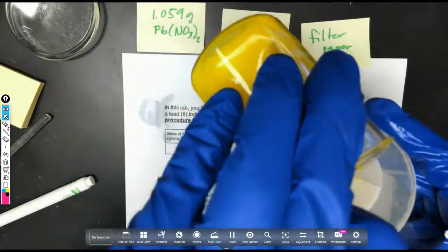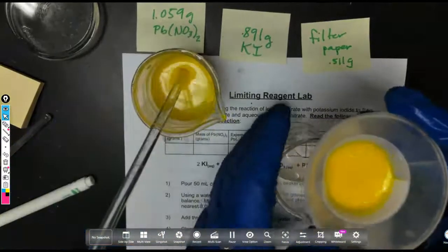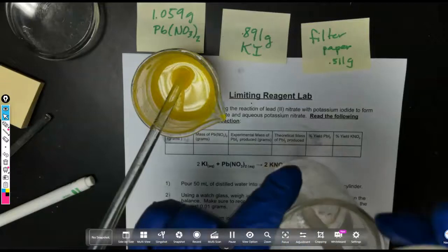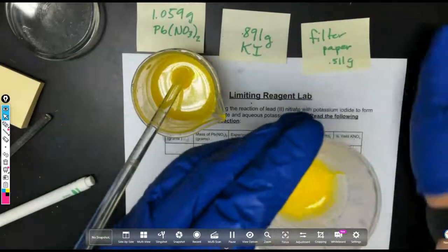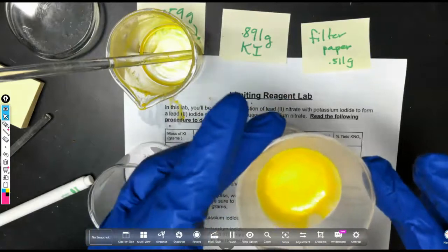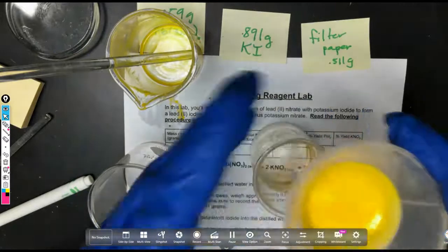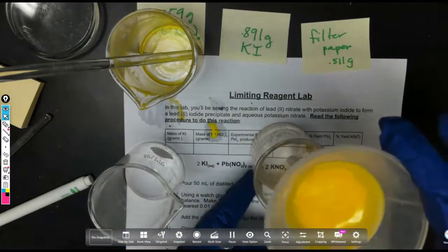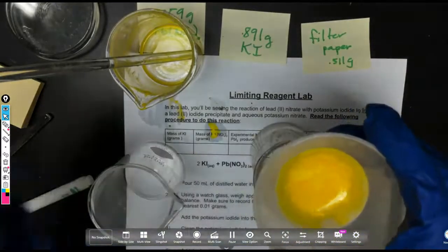So I'm going to start the filtration process. And as you can see, that is what it looks like right there. And it immediately starts filtering, and I'm getting a clear liquid as we go here. I'm going to pause my video and go ahead and get it all filtered for you as we go. Okay, we are getting close to the end of our filtering. There's still a little bit of liquid in there. You might also notice that I'm getting a clear solution that is our filtrate that is coming through, and I'm collecting the yellow particles of the solid in my filter paper.